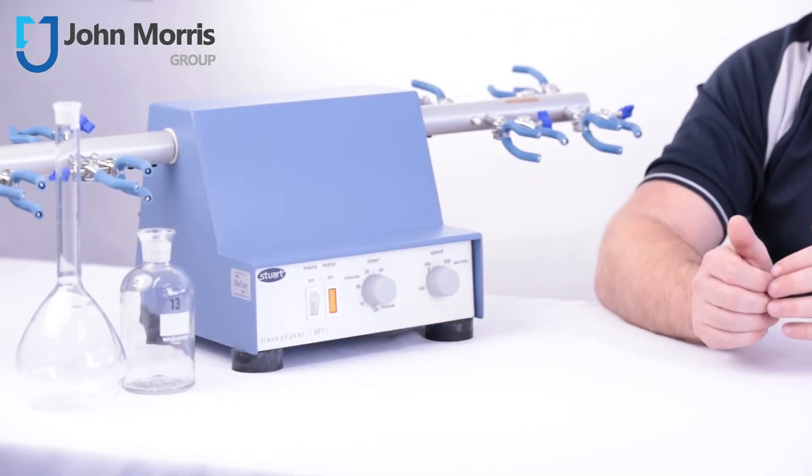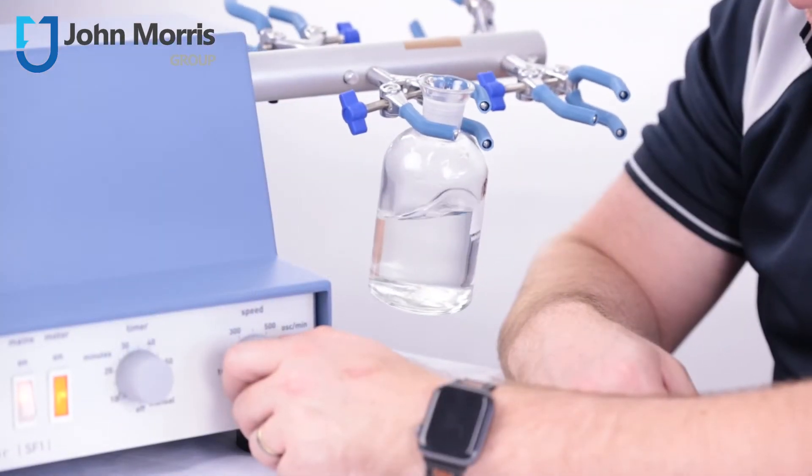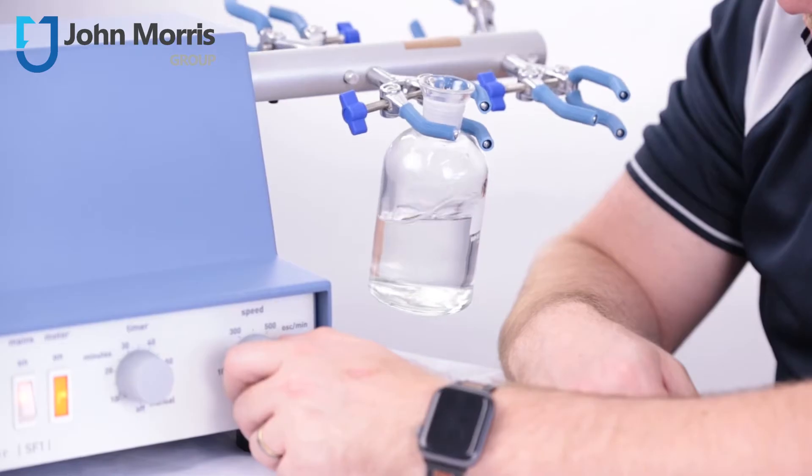Now, these handy apparatuses are used in laboratories to mix, agitate, or help keep substances in suspension in a tube or a flask. And they're particularly useful for applications where prolonged reciprocating shaking is required.